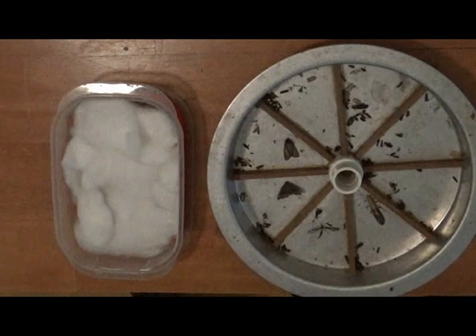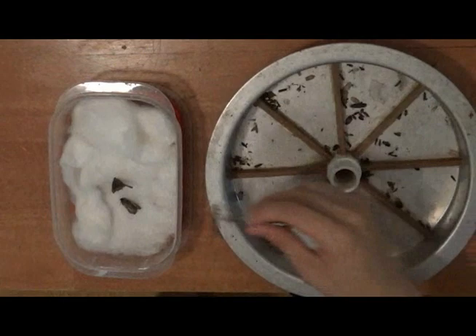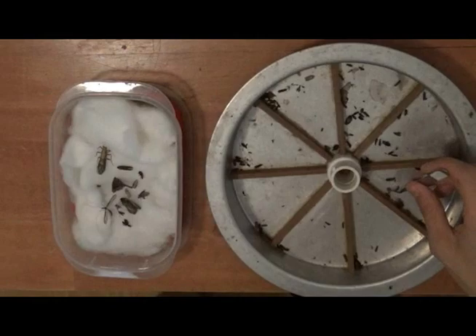The nice thing about the collecting tray I use is I can pull the whole thing out of the trap to sort through it more easily. Depending on the number of moths I caught, sorting can take anywhere from a few minutes to a good portion of the entire day. Using forceps, I can immediately field pin the insects or sort them into smaller cotton-lined containers to freeze and pin later at my convenience.